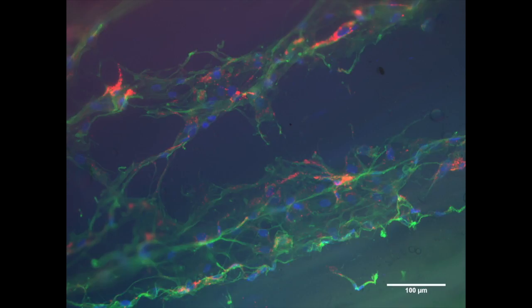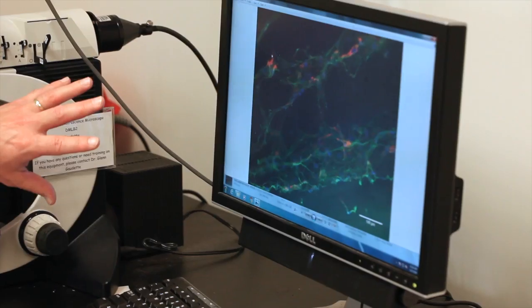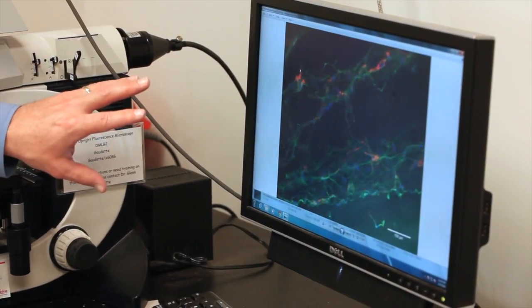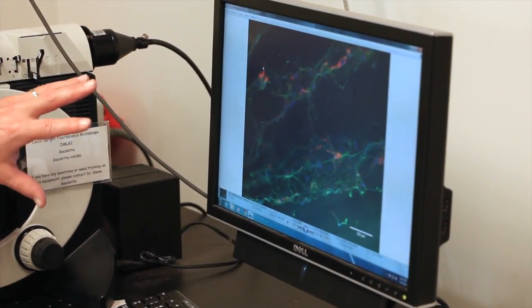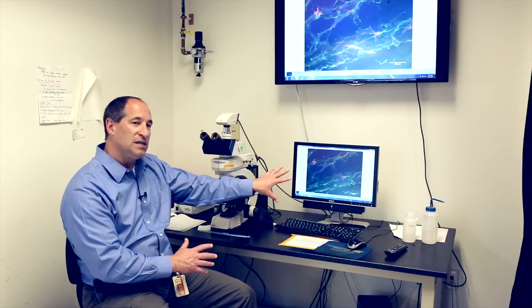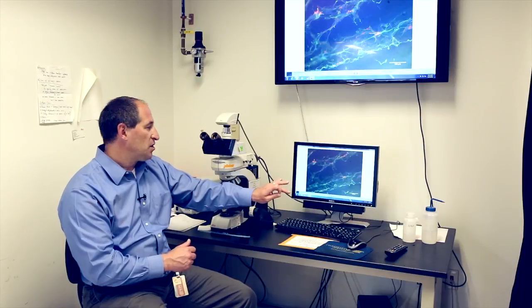What you see here is a combination of those three separate images put together in one image. We can see where the cells are—the quantum dot loaded cells in red—and the various proteins shown in blue. This one image is constructed from three raw images. We need to know the experiment number, section number, if it was from the apex or base, and which channel and protein we stained for.